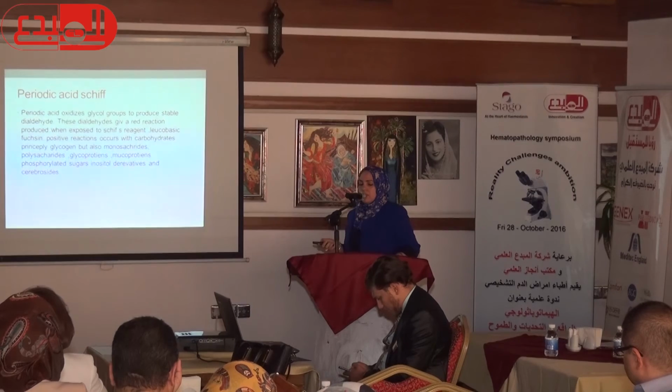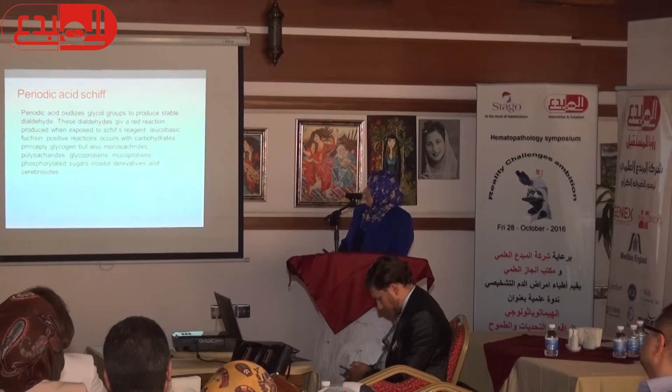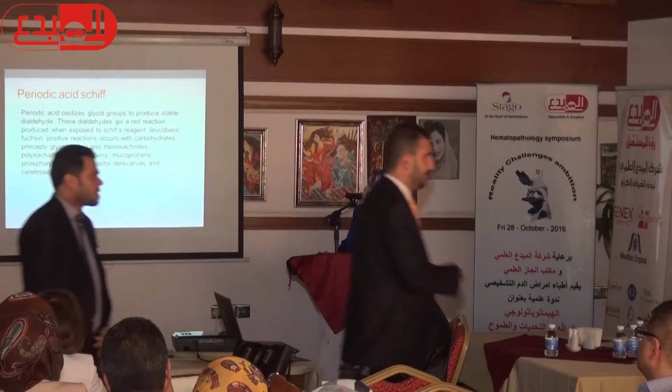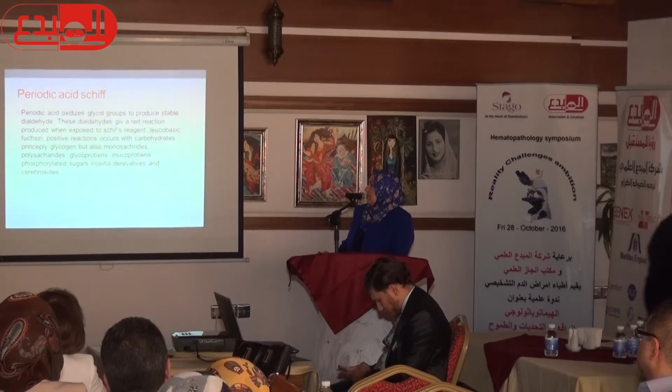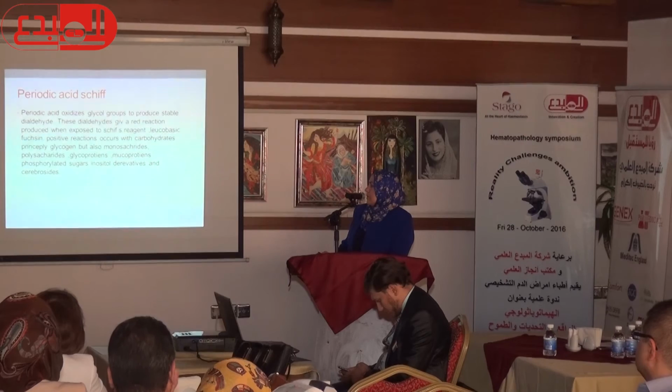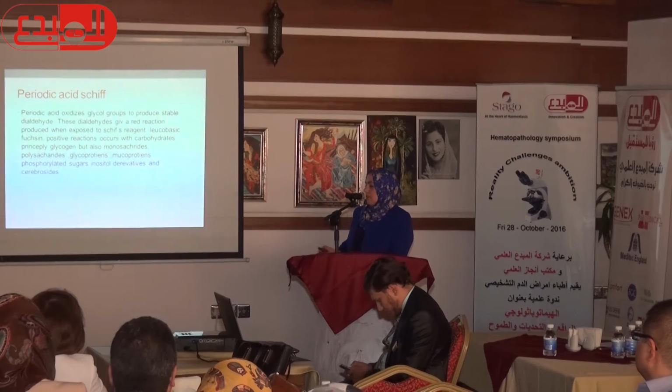The other available stain is PAS, or periodic acid Schiff. Periodic acid oxidizes glycol groups to produce stable dialdehyde. Those dialdehydes give a red reaction when exposed to Schiff reagent. Positive reactions occur with carbohydrates, principally glycogen, but also monosaccharides, polysaccharides, glycoproteins, mucoproteins, phosphorylated sugars, inositol derivatives, and cerebrosides.